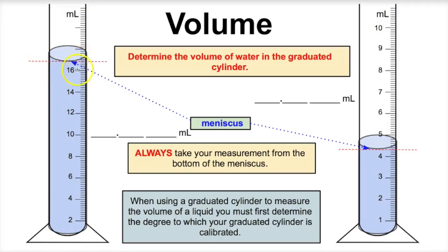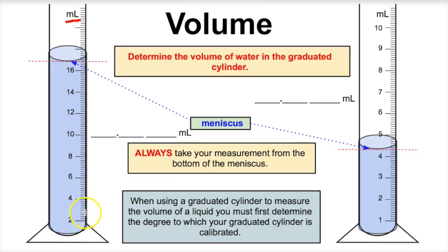It's important to get eye level with that meniscus. We also want to figure out how our graduated cylinder is calibrated. We see that this is milliliters, and the big lines are 2, 4, 6, 8. Counting the lines in between, there are 9 little lines in between. That means each one of these little spaces represents 0.2 milliliters. So we have 2.2, 2.4, 2.6, 2.8, 3.0, 3.2, 3.4, 3.6, 3.8, and 4.